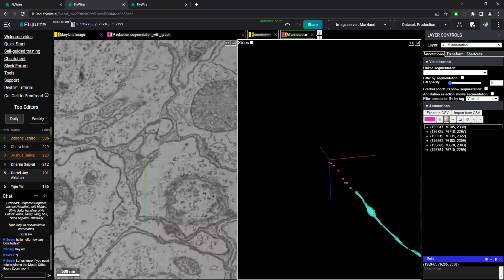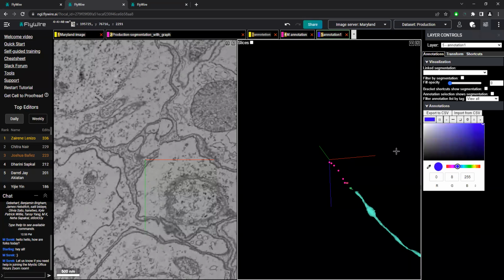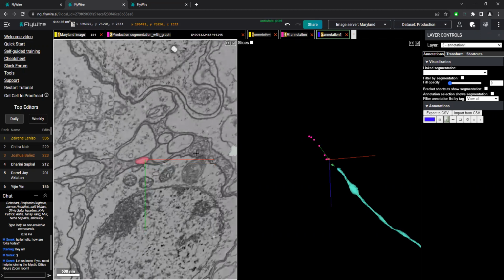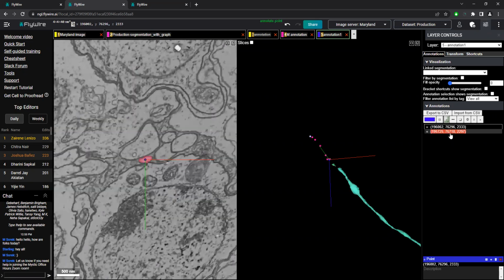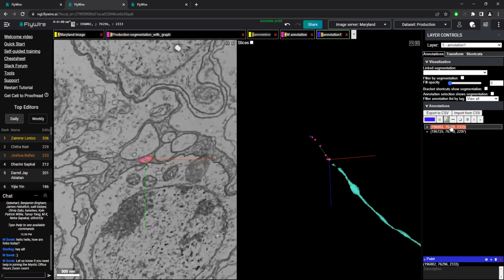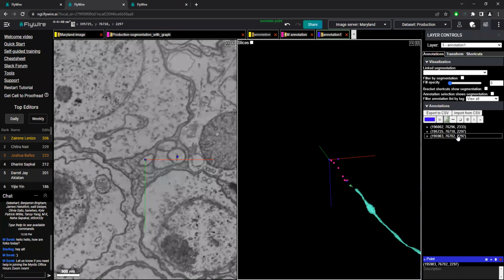What we could do is I'm just going to create a new spot here, and I'll just make something where, all right, we began here, bring that up, control click, and then we ended here. And I could just teleport in between, and then I don't have as much of a shift issue, and it allows me to better see, okay, yep, that's the correct one. Now, let's say that we couldn't tell what was the correct one, but we know for a fact that maybe we have this distinctive one over here to help us, maybe pinpoint it. Let me just trash all these.